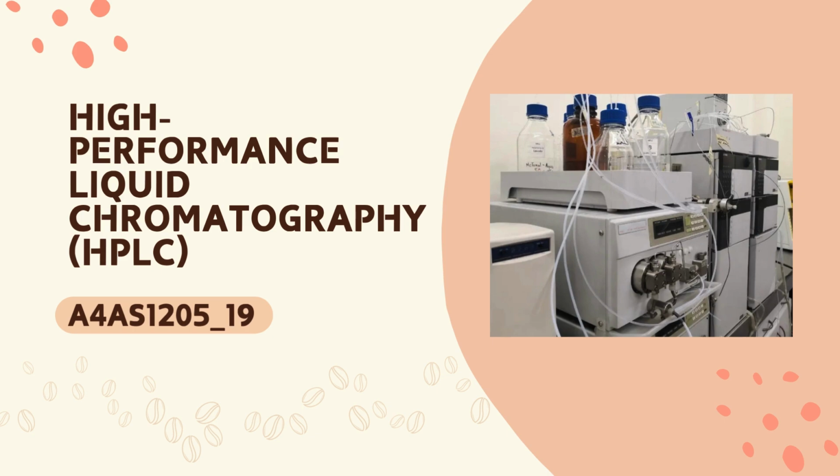Over the next 10 minutes, we will guide you through the fundamentals of HPLC.